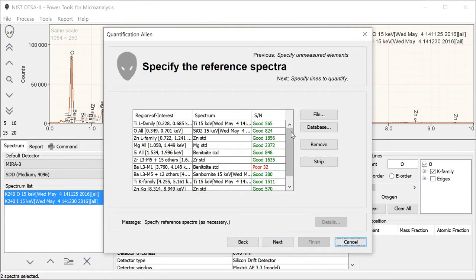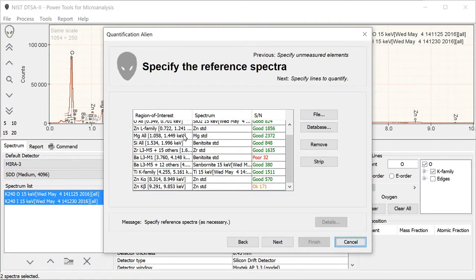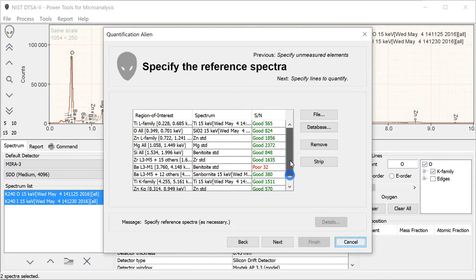When we get over to this page, this is where we've saved ourselves a lot of work. We've already entered in a reference for the titanium L family, and it is read out of the standard bundle. We've already entered a reference in for the oxygen K. It's read out. For these other elements, we don't need a reference. But if one was needed, it would be read out of the standard bundle. Usually, if you use standard bundles, you can step right through this without any extra effort.